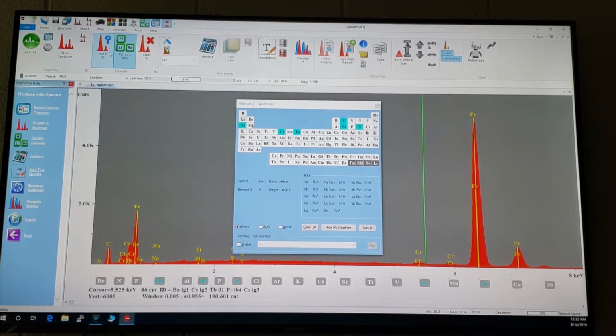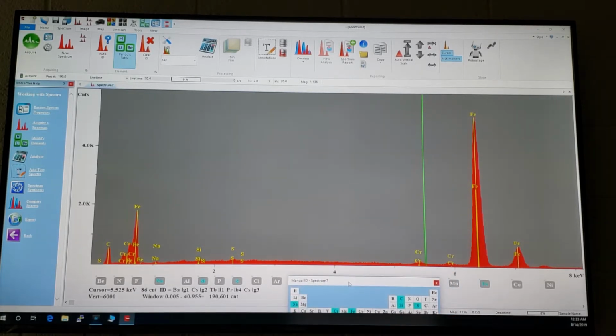Just know it may give you arbitraries, because when it's guessing itself, it may give you some nonsense. In this case, it didn't. It labeled everything pretty well. Is there a percentage on that, Jim, when you auto? Is it ignoring everything under? No, it's just hunting, but very quickly.